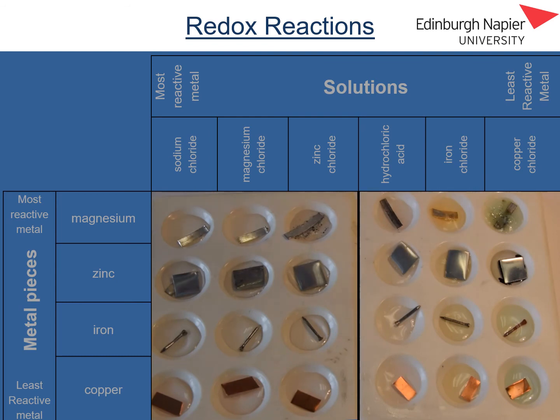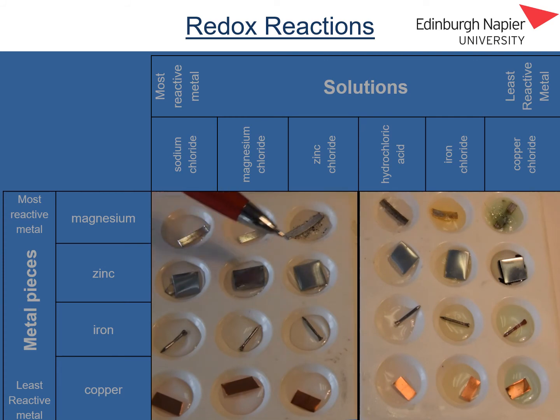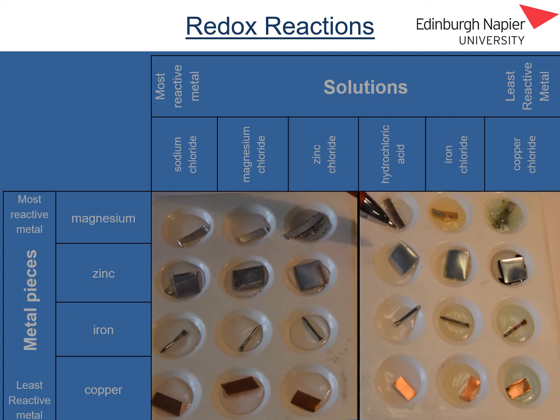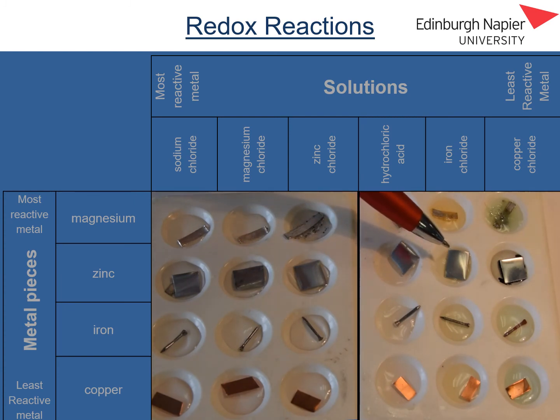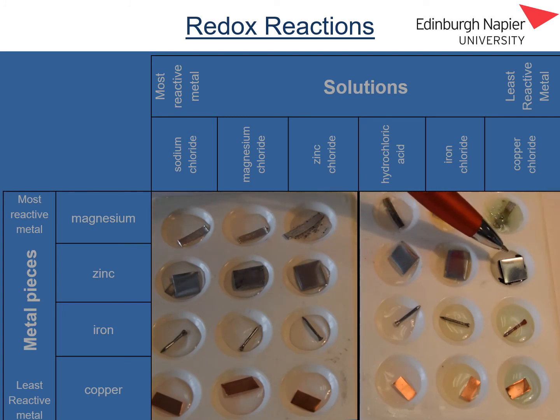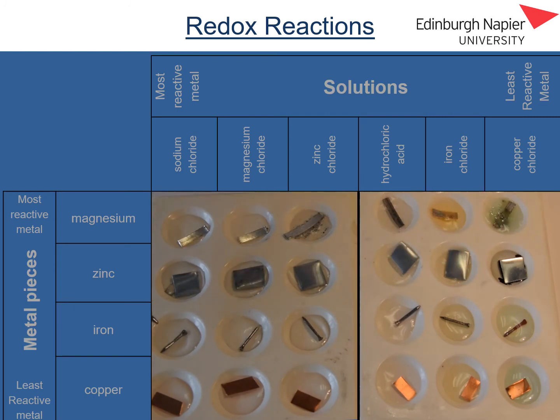Looking at zinc now, there is no evidence of a reaction of zinc with sodium chloride solution, magnesium chloride solution, or zinc chloride solution. Looking closely at the reaction of zinc with the hydrochloric acid solution, there is evidence of bubbles being formed. There's a slight colour change with the iron chloride solution, and we can clearly see evidence of zinc having reacted with the copper chloride solution.